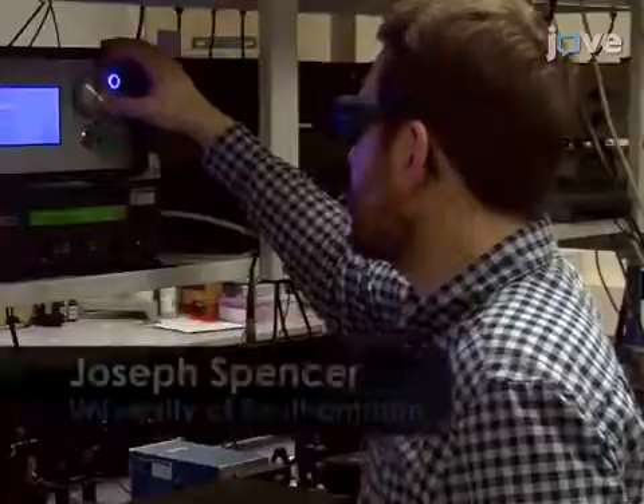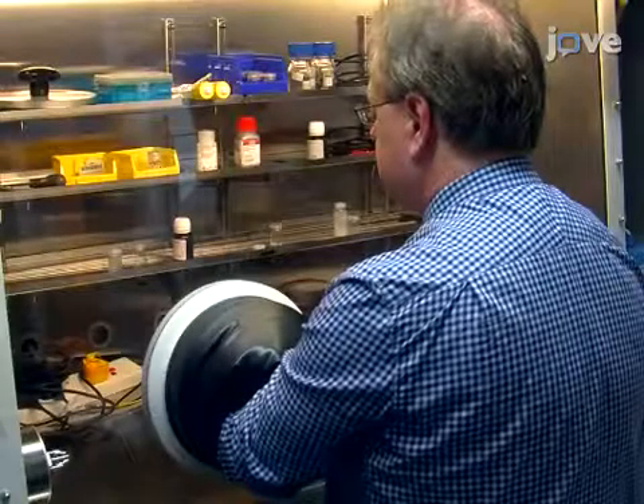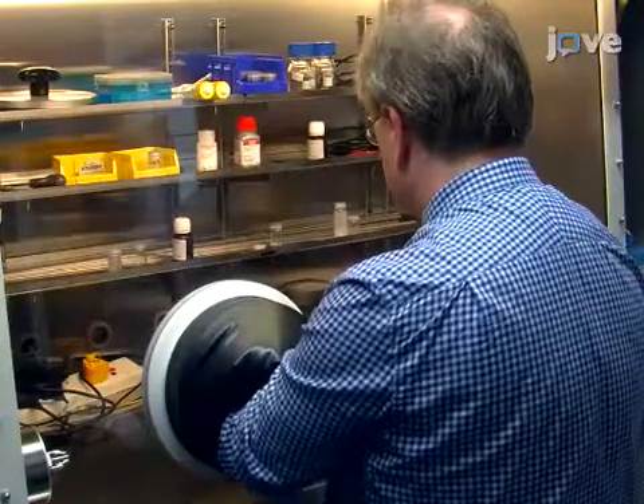Joe Spencer, a grad student in my lab, will be demonstrating the Raman experiments. To begin this procedure, preheat approximately 50 milligrams of single-walled carbon nanotubes to 450 degrees Celsius in dry air.